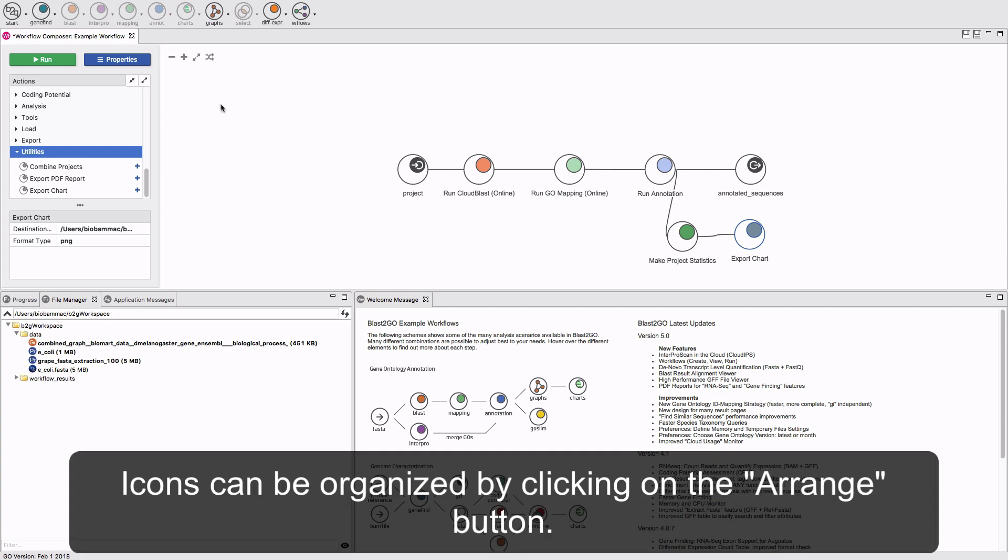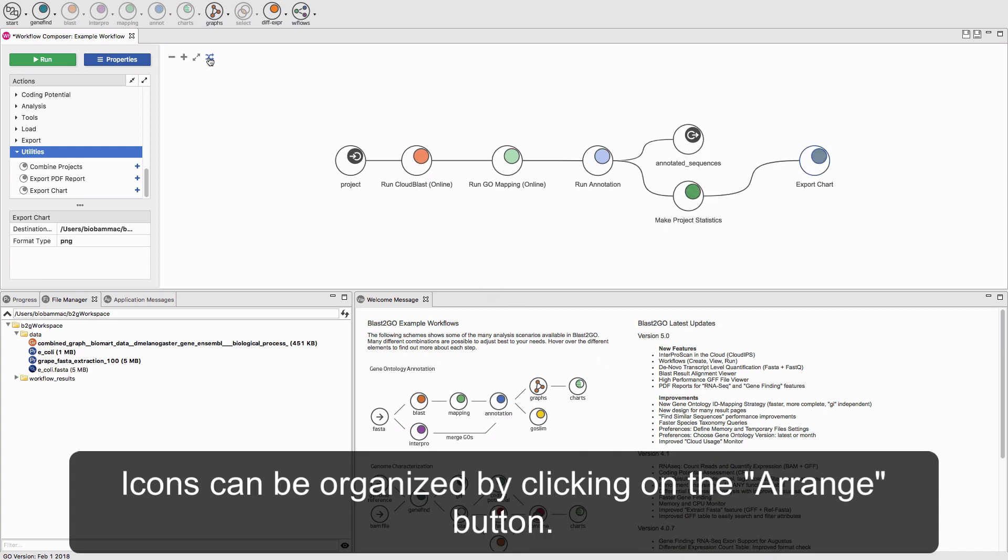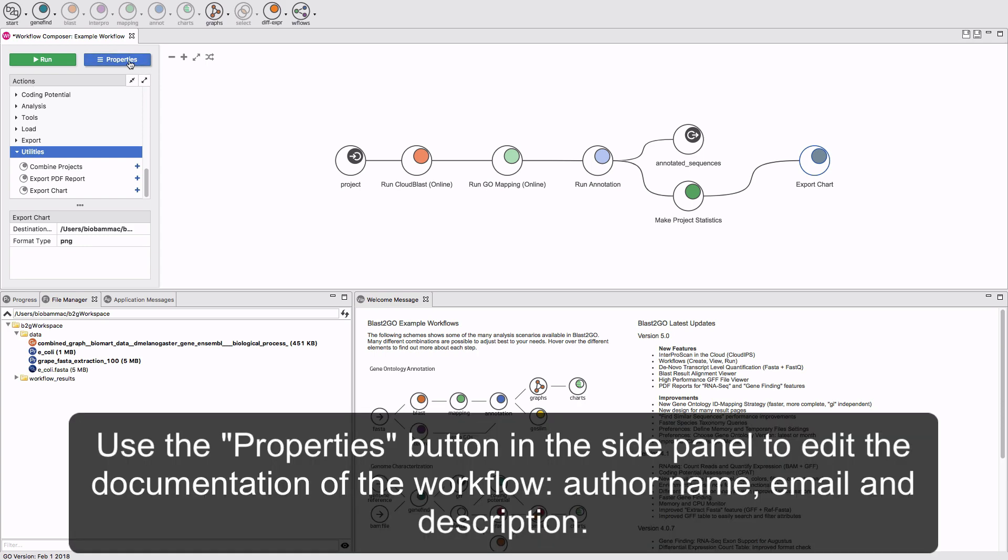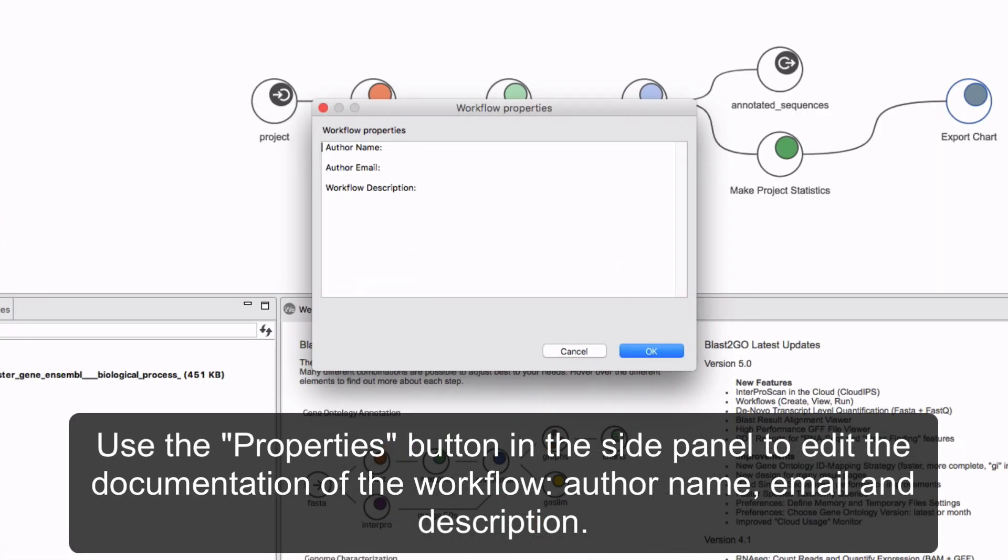And the destination folder should be established. Icons can be organized by clicking on the Arrange button. Use the Properties button in the side panel to edit the documentation of the workflow, for example author name, email, and description.